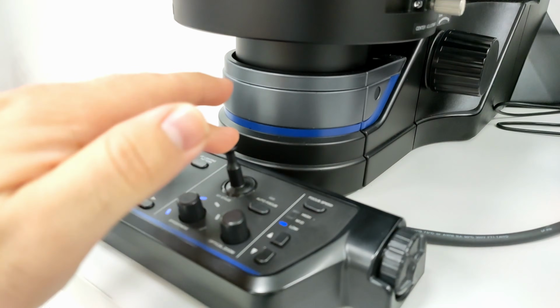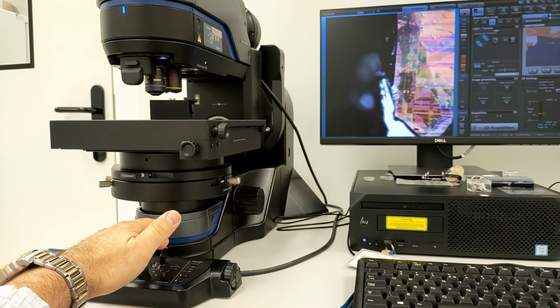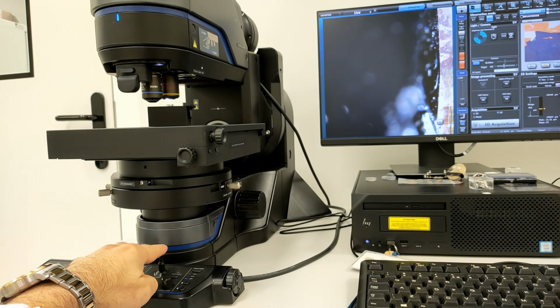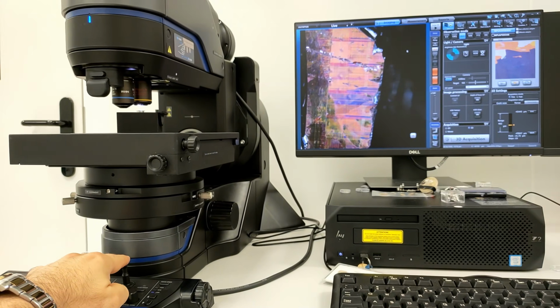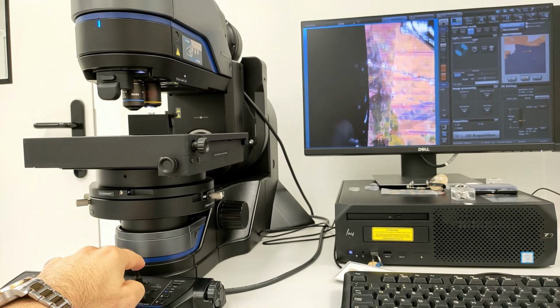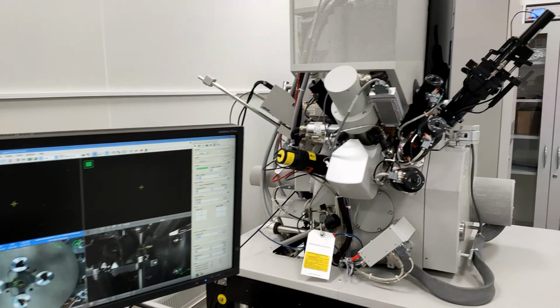The optical microscope used in this video is the Olympus DSX 1000. It is a high-end metallographic optical microscope. Its price is above $20,000. It is mainly a very good optical microscope. The raw image quality is comparable to standard high-end optical microscopes.